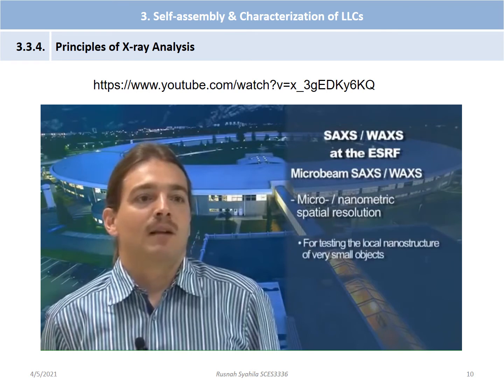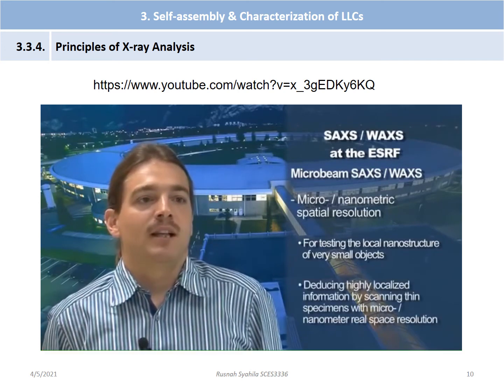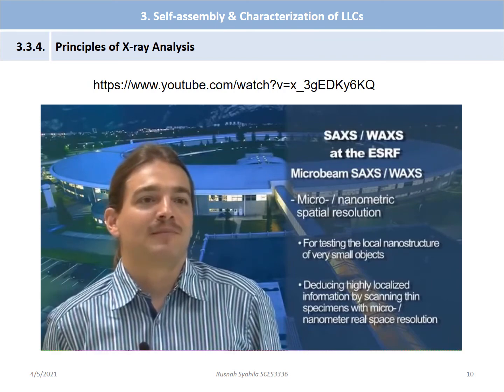For testing, for example, the local nanostructure of very small objects, but also deducing highly localized information by scanning thin specimens with micro and nanometer real space resolution.